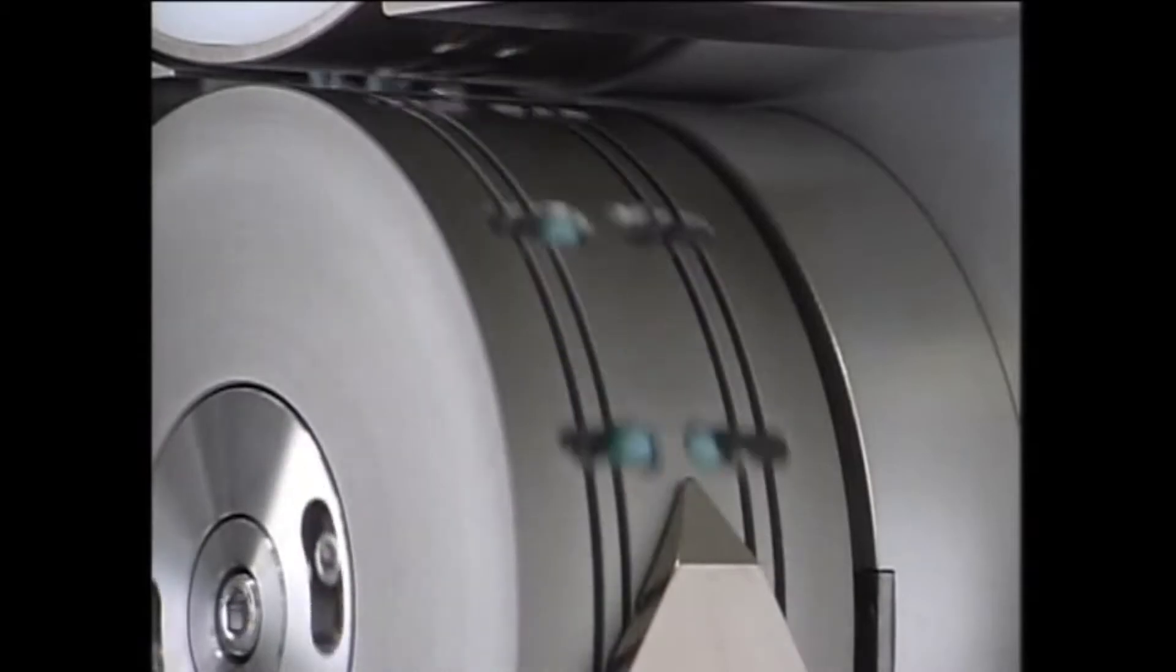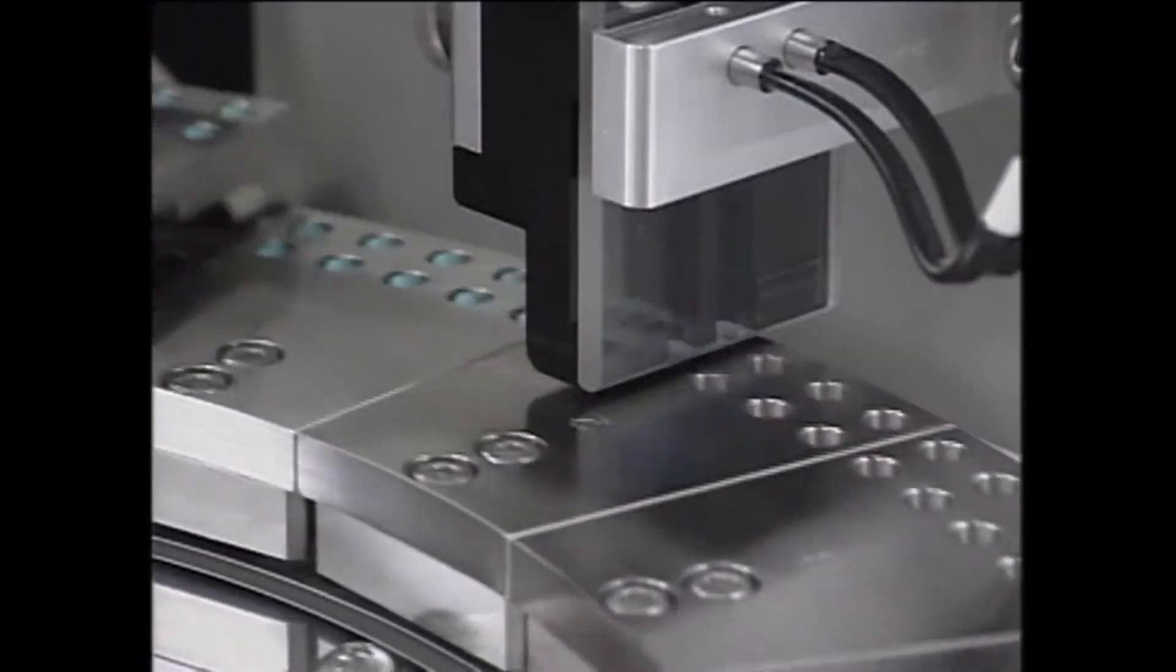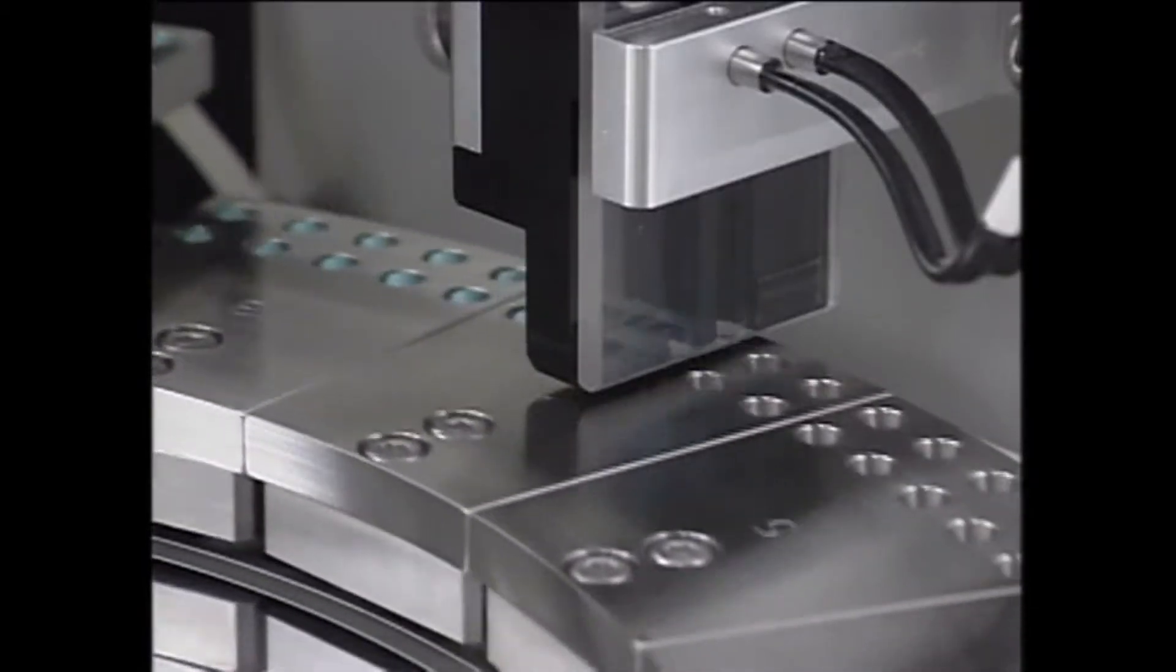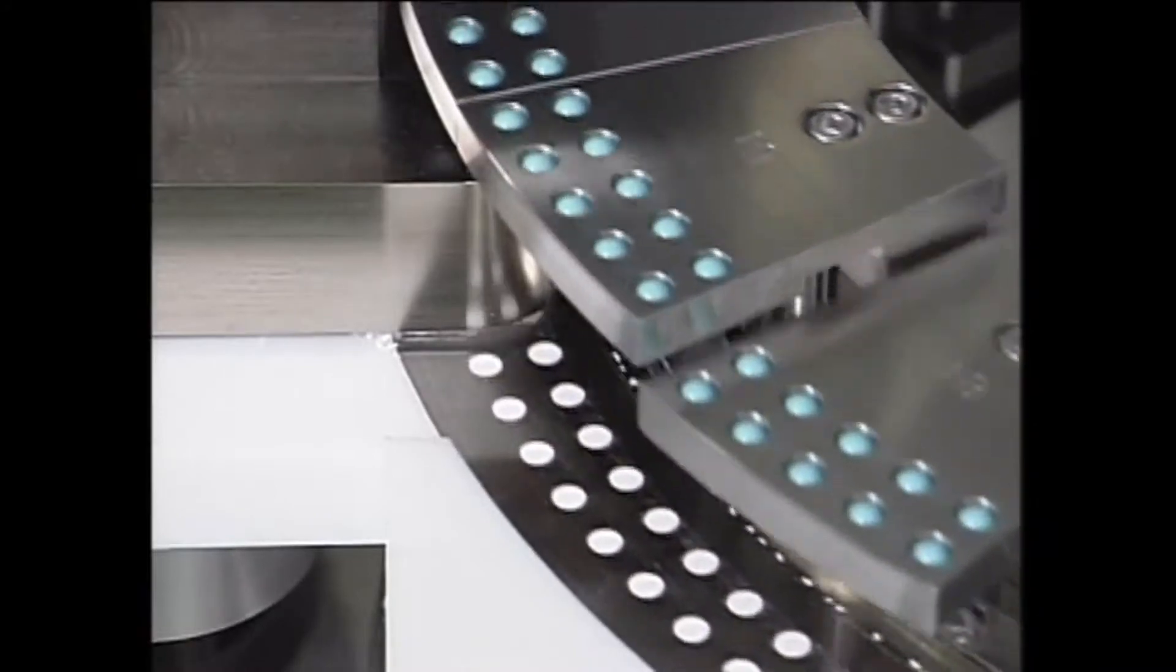Even though this filler is compact and small, it can efficiently handle powders that are unable to be used by fillers based on the compressed and vibration filling system.